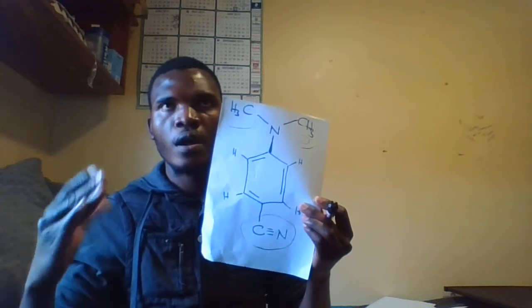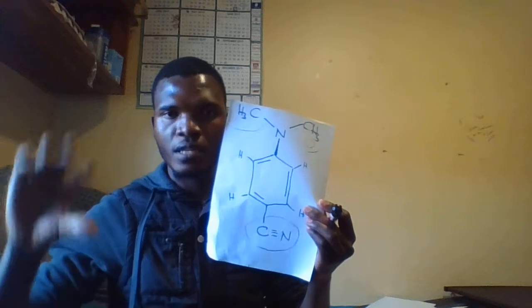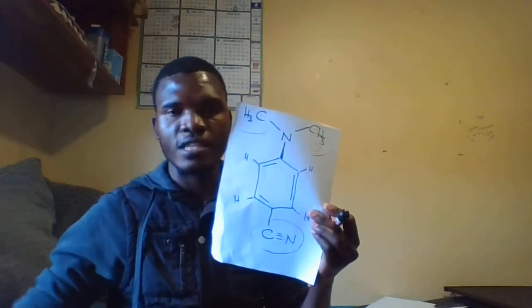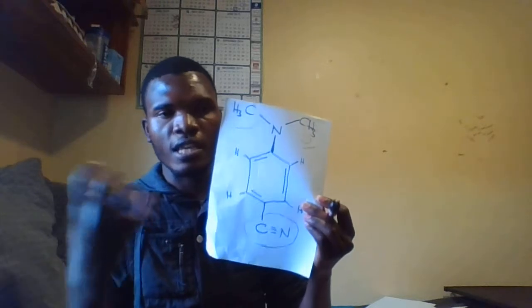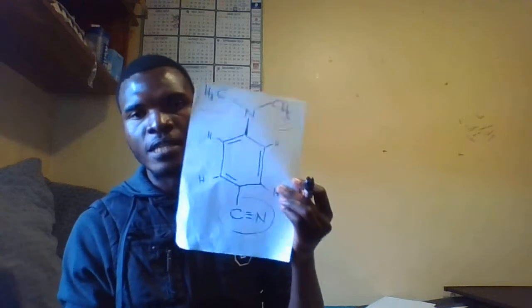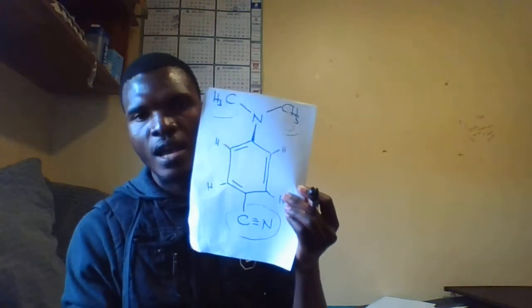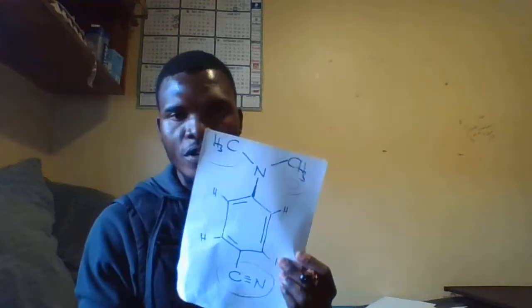When you Google your C9H10N2 based on the variable structures, you will be able to pick out the structure that corresponds to the pieces that you have. But I'm gonna show you another approach on putting pieces together in the next coming videos.